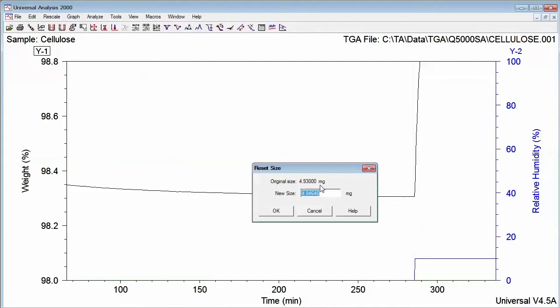Select Enter. The initial sample size has gone from 4.93 to 4.85 milligrams. This new weight will be used as the initial 100% sample size.